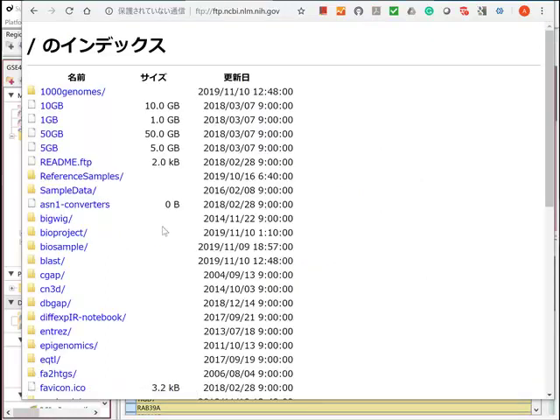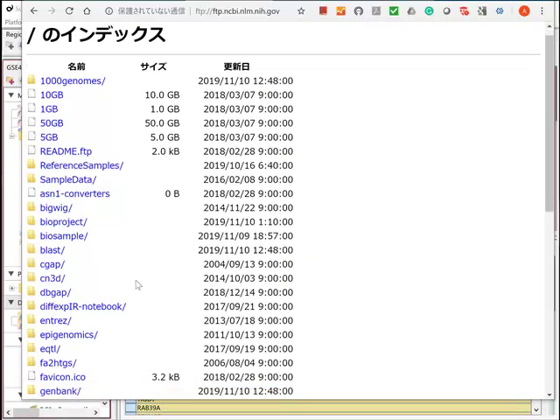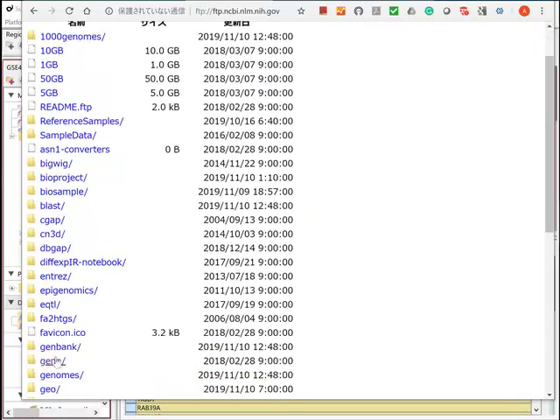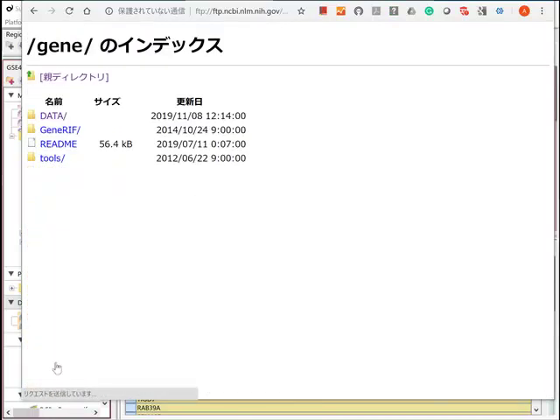You get gene2go and gene_info files from NCBI's FTP site.